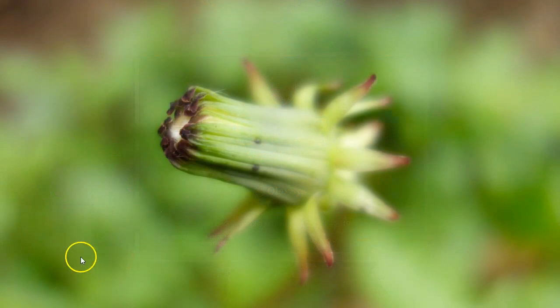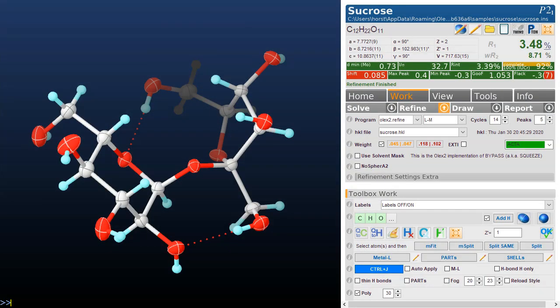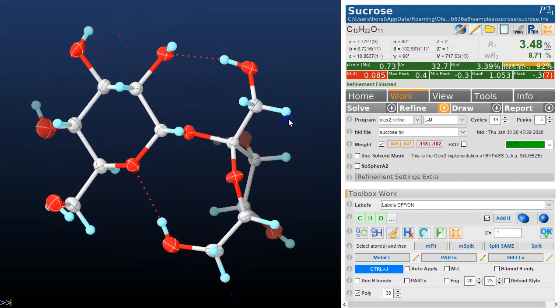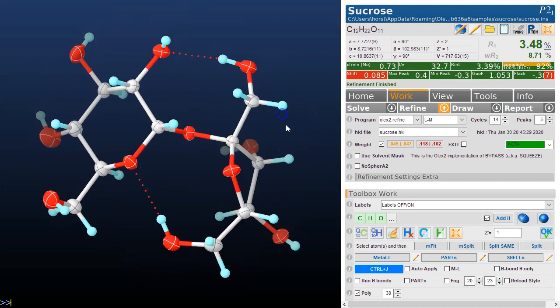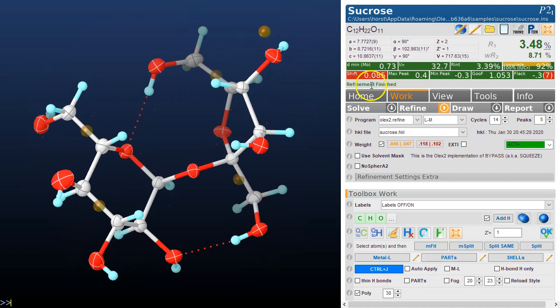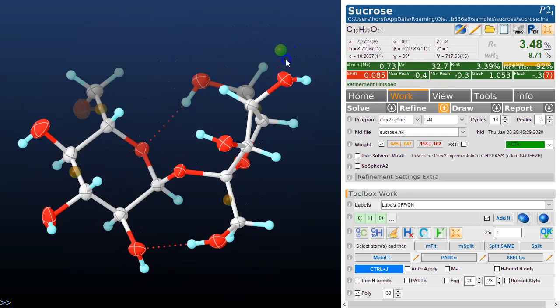Today we will look at residual electron density. If we look at the structure of sucrose, it's looking all very well until we switch the Q peaks on and we see there's a few Q peaks here, namely this one. If I click on this, this is Q1, the biggest peak.